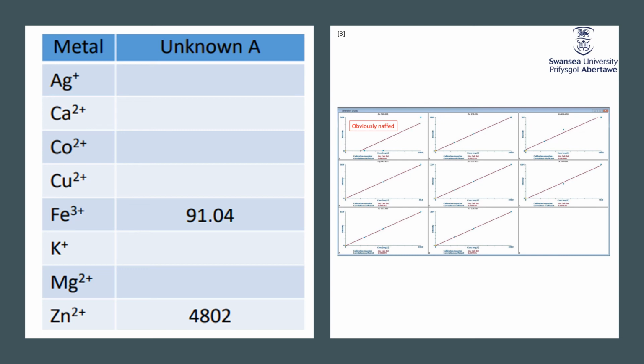The absence of silver and magnesium could have been accounted for due to the poor calibration of the machine when run with silver. As we can see, the correlation coefficient is very low compared to the other ones and a lot lower than 1, and the point values in the graph are very scattered and unaligned.